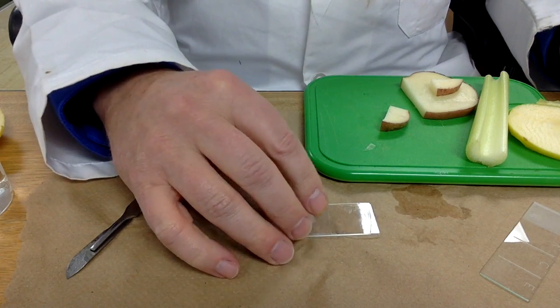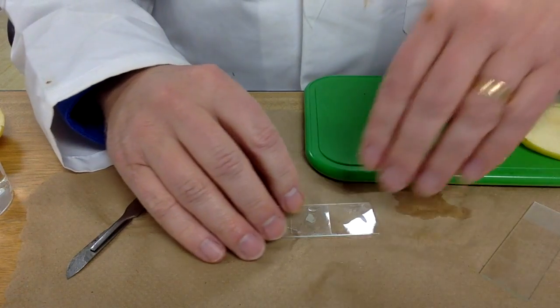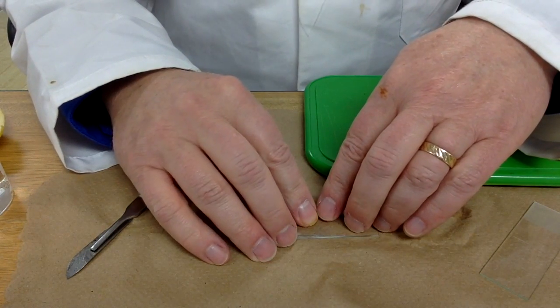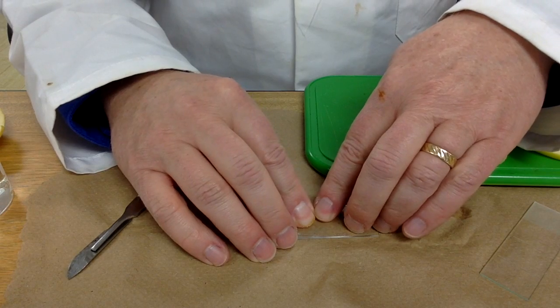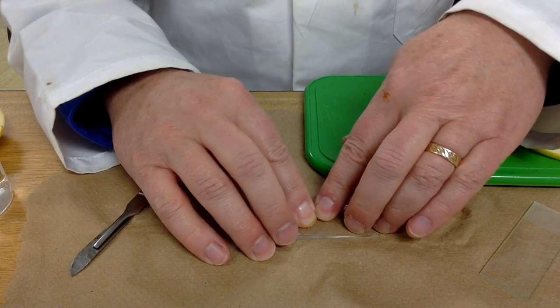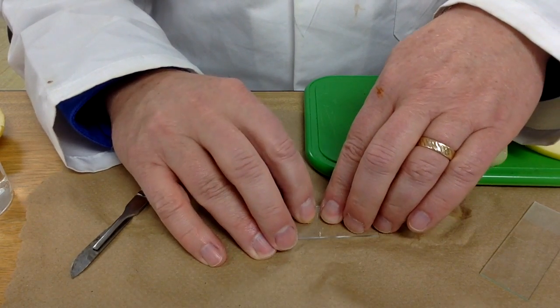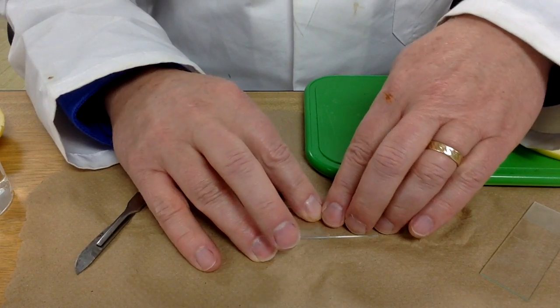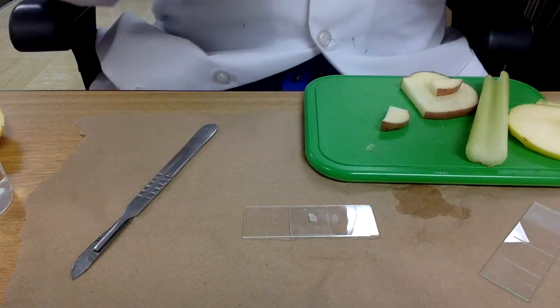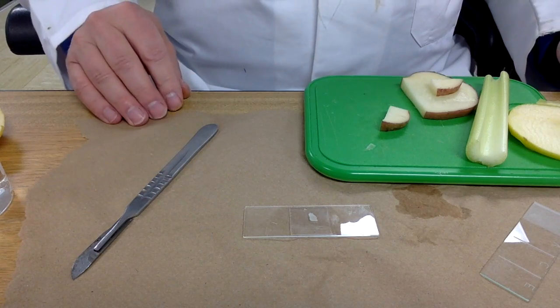And then with something as soft as potato, we can push down on that, right on the cover slip, and spread some cells out a little bit. That is ready for viewing under the microscope.